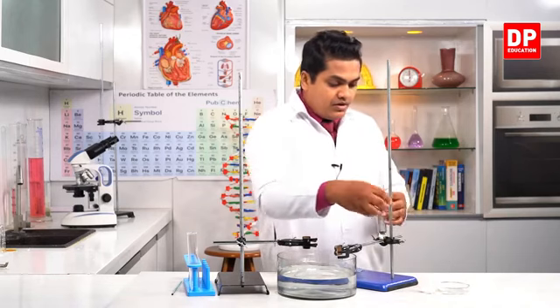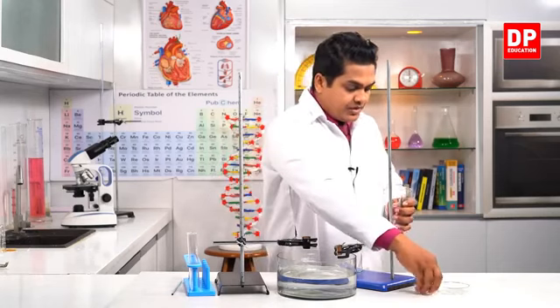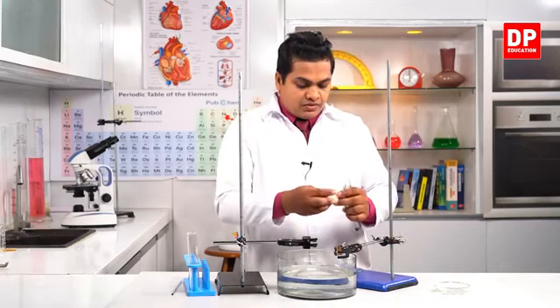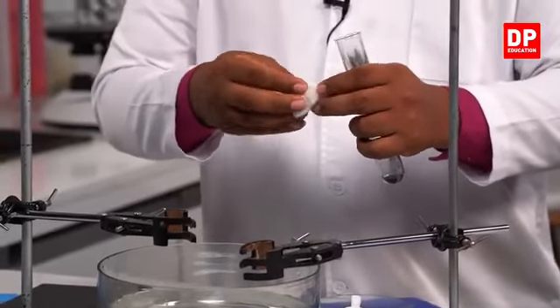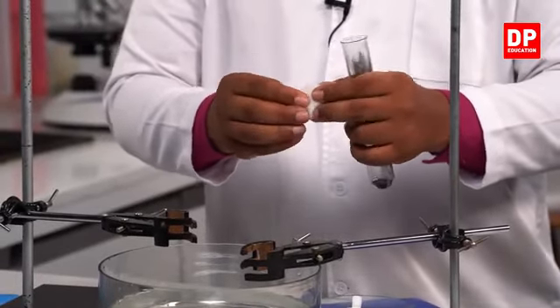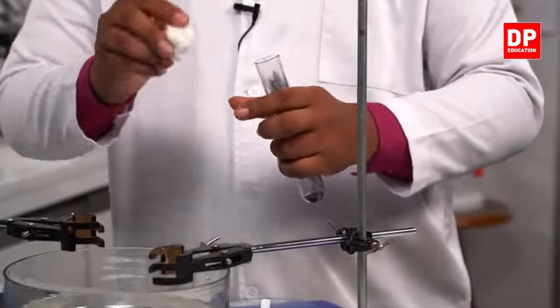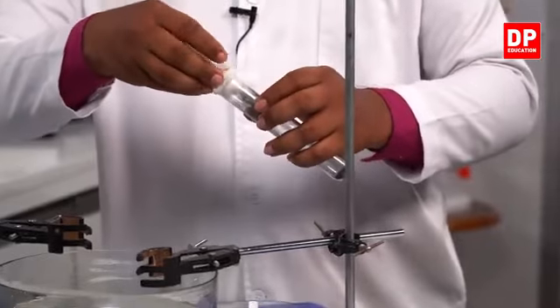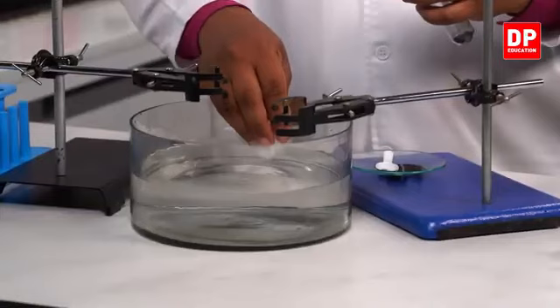You have to take some amount of cotton wool, otherwise the iron powder will fall into the water trough. Right, that's enough. So I'll dip it in water.